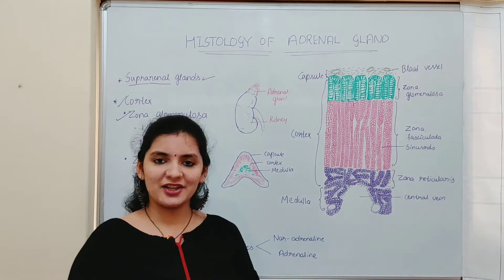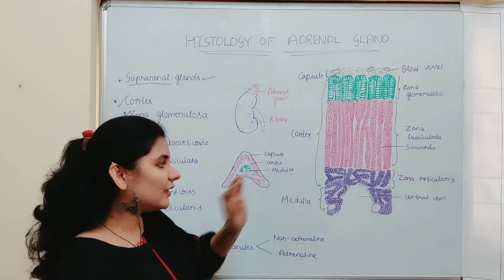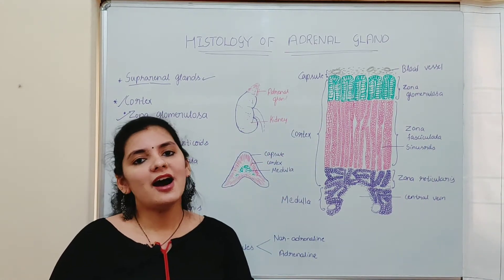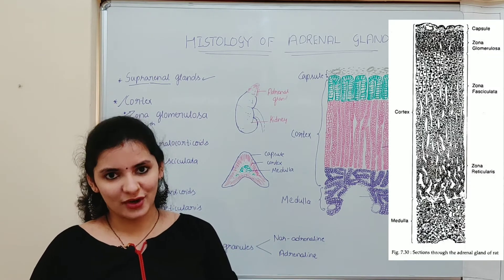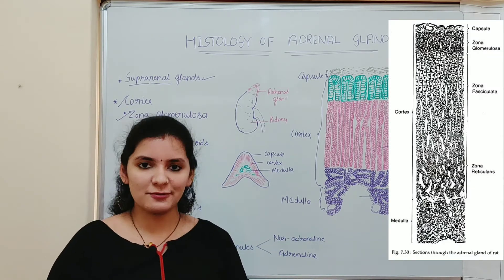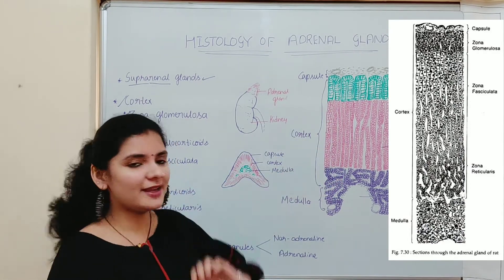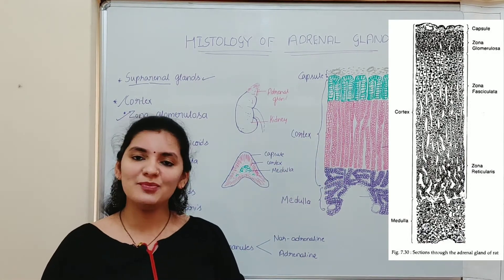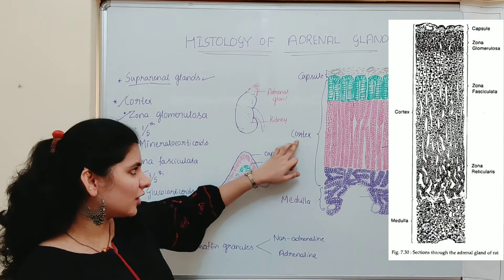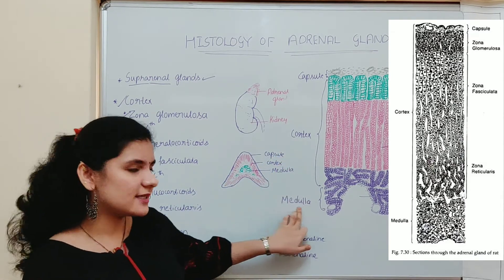So these are the three layers of the cortex: zona glomerulosa, zona fasciculata, and zona reticularis. Together, the cortex region secretes hormones called corticosteroids, which perform different functions. This division is purely based on the arrangement of cells.